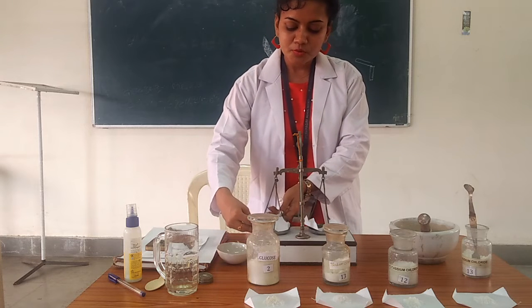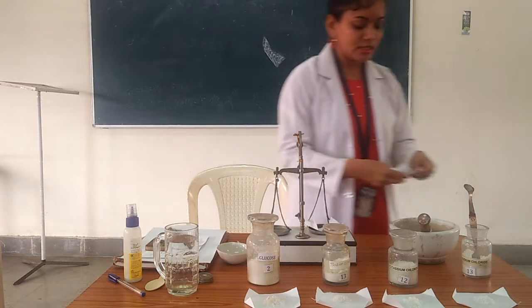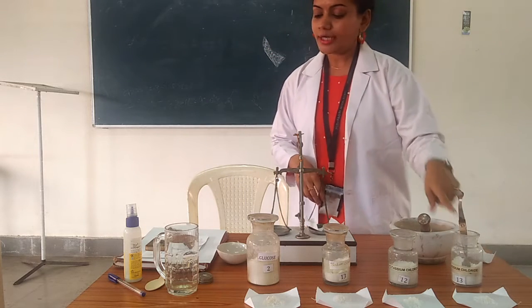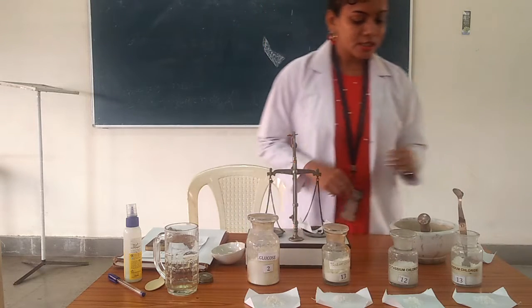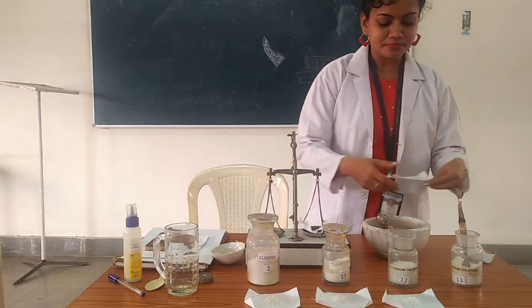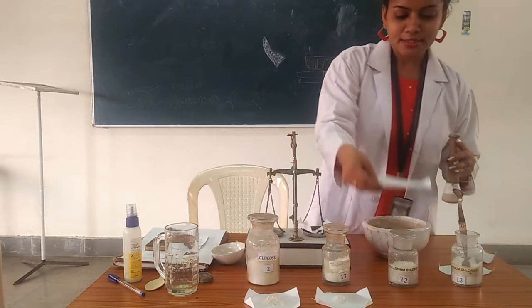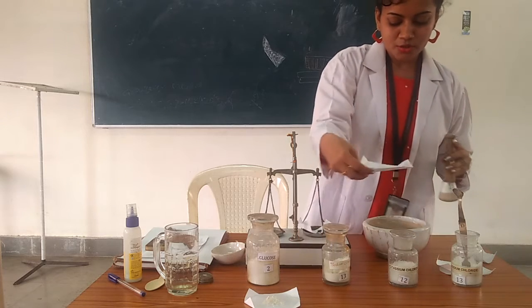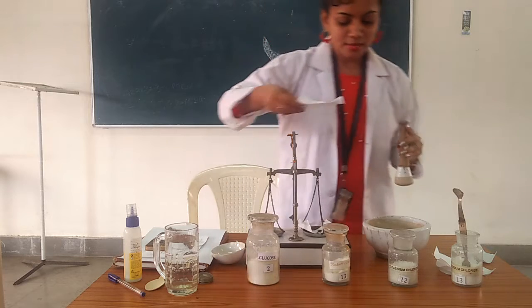Now we have weighed all ingredients: sodium chloride, potassium chloride, trisodium citrate, and glucose. We transfer all these ingredients to the mortar. I have already weighed all ingredients based on the WHO formula, and now we transfer them to the mortar and pestle, which is mainly used for mixing.